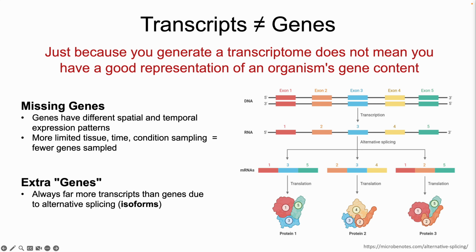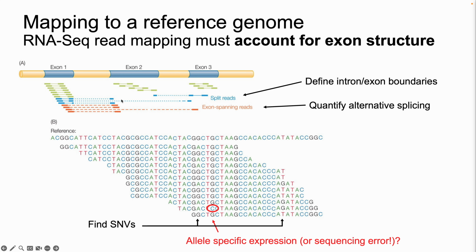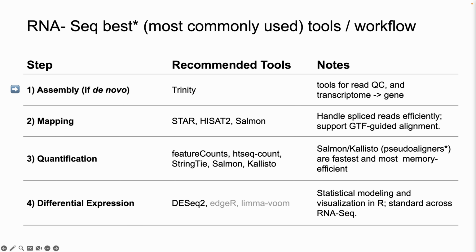models. And I've mentioned a couple times a benefit of RNA-Seq is the intron-exon junction, right? Gene prediction software often gets those wrong. Like there's an extra reading frame that it didn't include in the gene model. RNA-Seq will tell you for sure, very precisely, which nucleotide ends the reading frame and starts the intron. Okay.